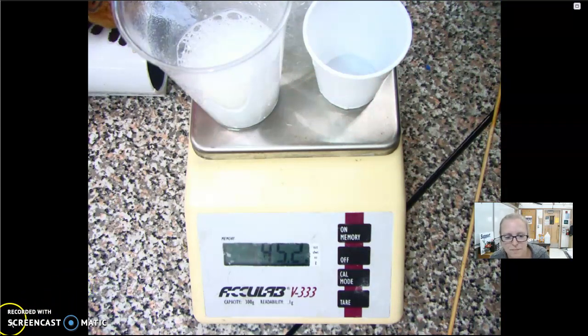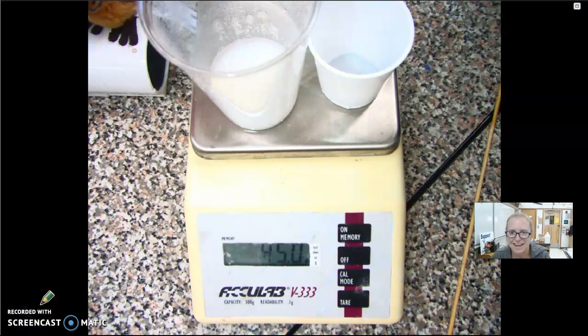Okay, we are back, and the reaction has subsided. The foaming has slowed down, and we have a final mass of 45 grams. So go ahead and record that. And at the end, we're going to do one more trial, and then you're going to take the differences of all of those and probably have to do an average too.